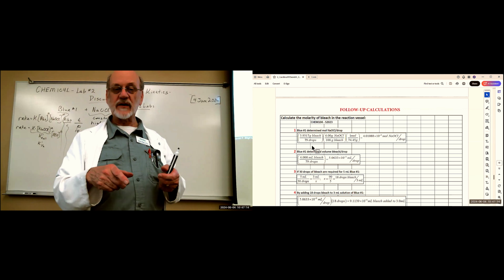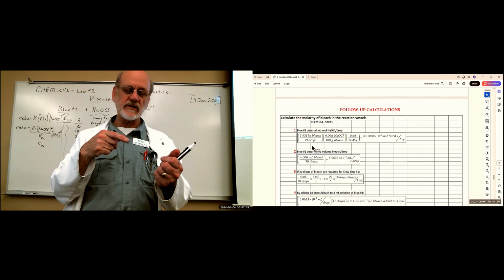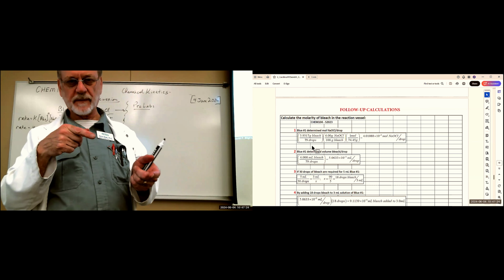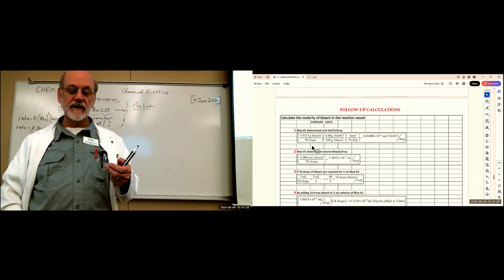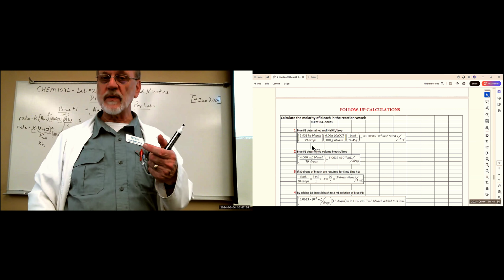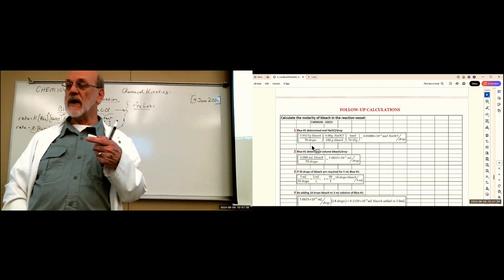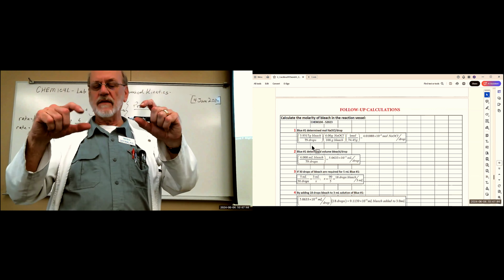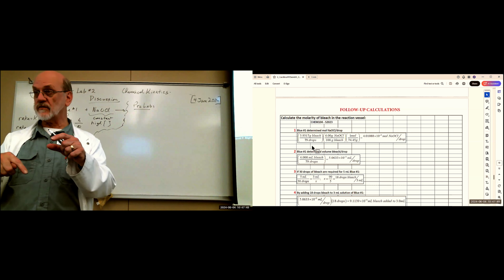And we use that plus the concentration. Density, I don't need density, not for this calculation. You just need the concentration, which is 6 grams per 100 grams, and the molar mass. And that will give you the number of moles of sodium hypochlorite that you added for every drop. Okay, so if you add, I don't know, 30 drops to that 3 milliliters, then 30 drops times that value will tell you how many moles of sodium hypochlorite you added to that reaction vessel.